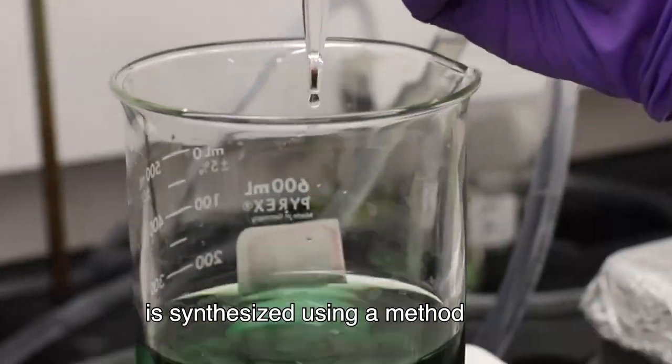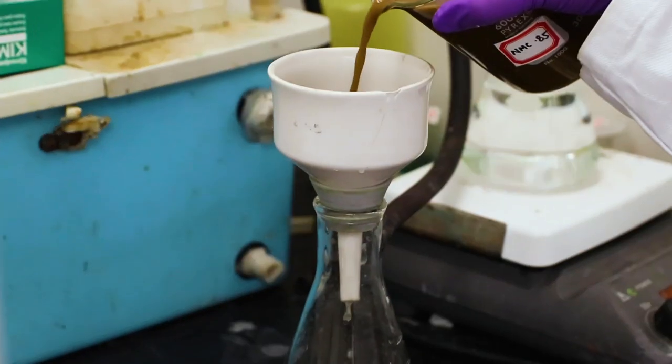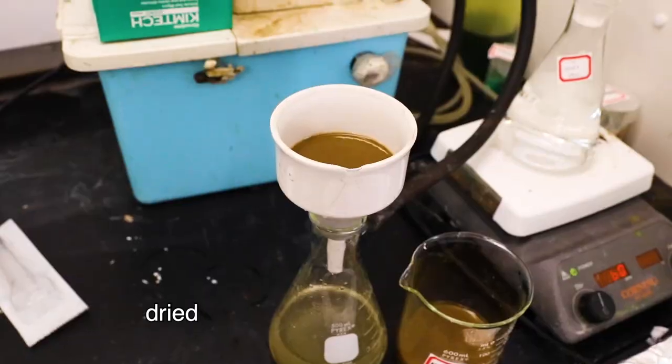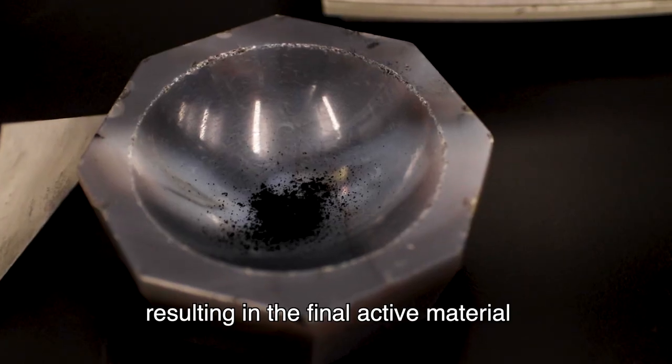The cathode is synthesized using a method called co-precipitation. The precipitate is filtered, dried, and heated with a lithium source in an oxygen furnace, resulting in the final active material.